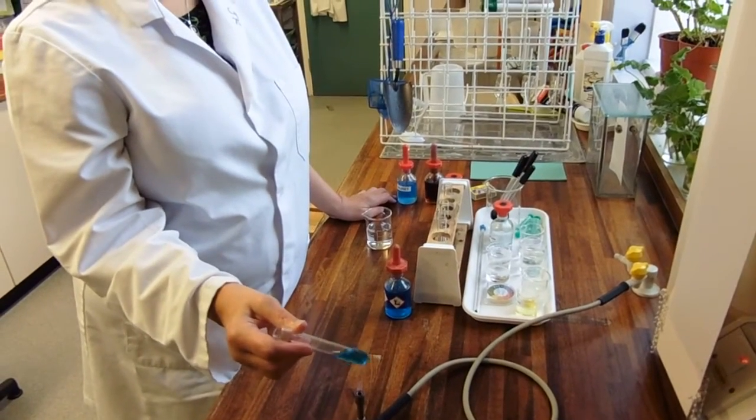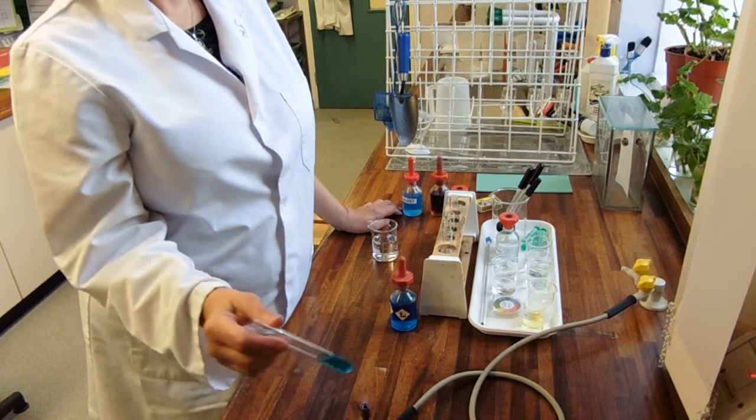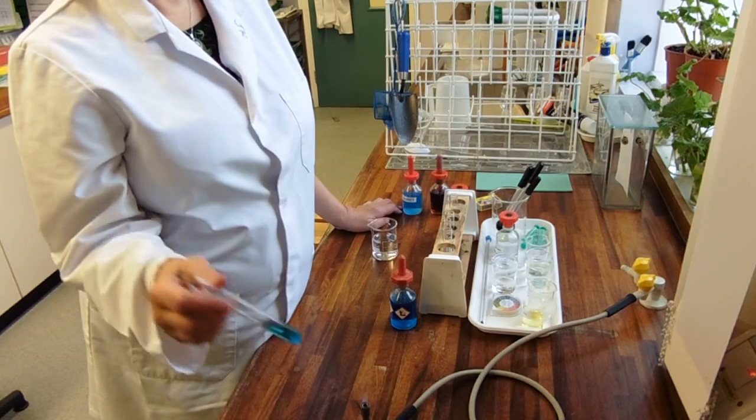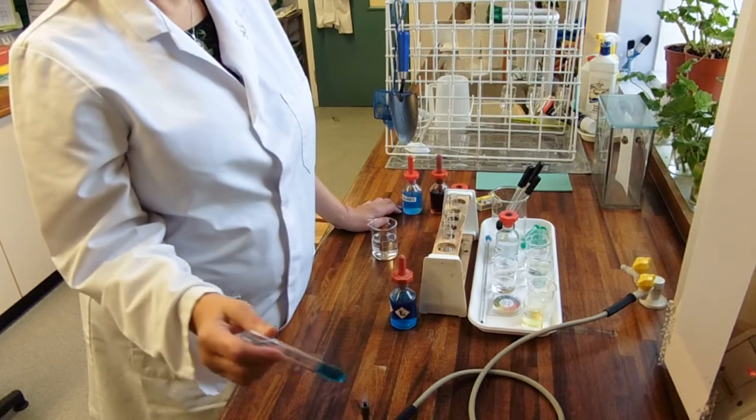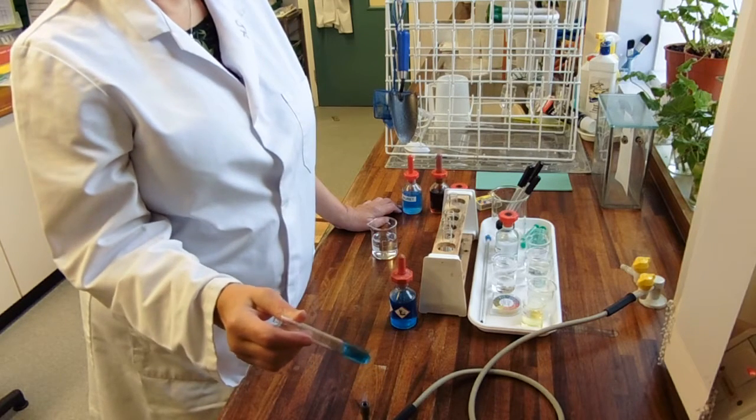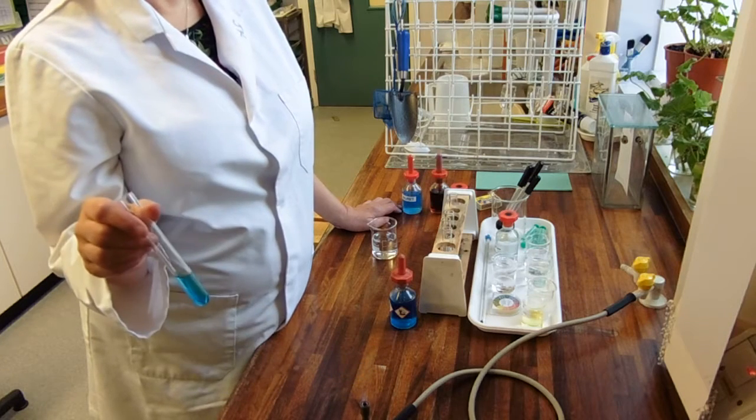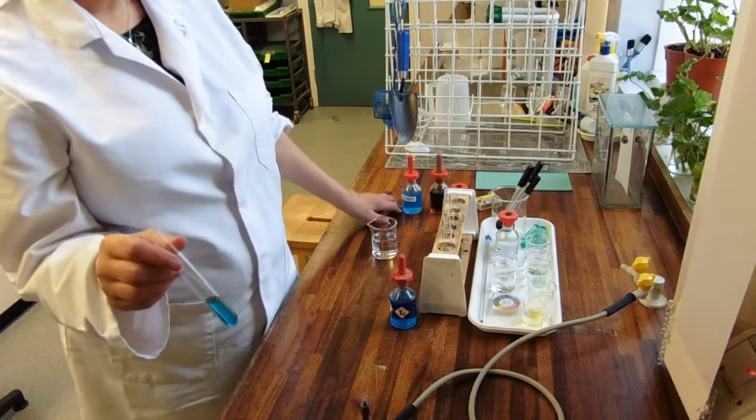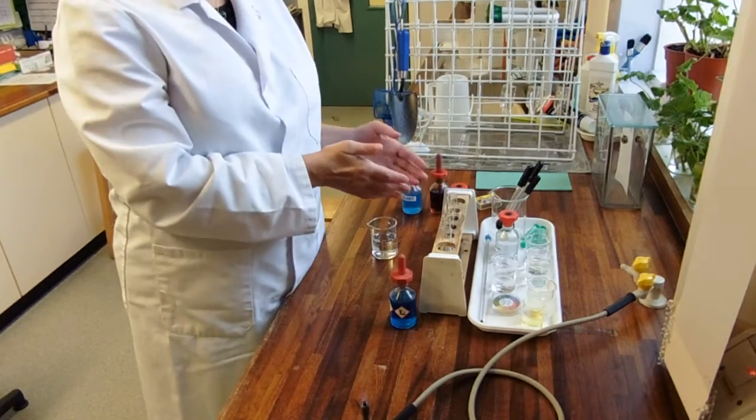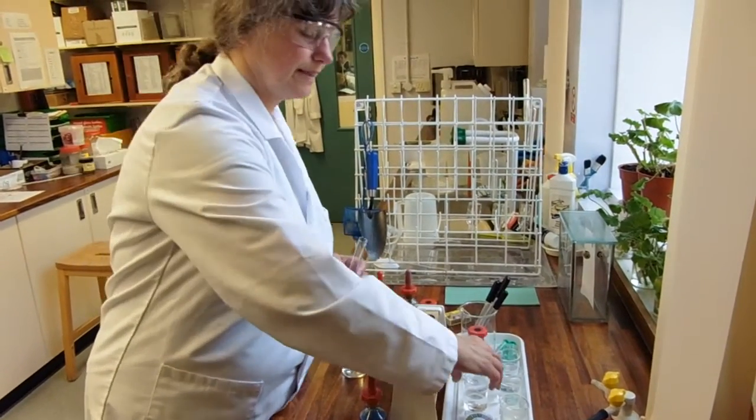So if you can imagine, if you were testing say, sugar-free coke, has it really not got sugar in? You might take Benedicts, you'd heat it up, it's not going to change colour. But if the manufacturer, if you're drinking roller cola and the manufacturer's decided to cheat, to give it a bit of flavour and has put some sucrose in, that still wouldn't show up. So, after you've heated your sucrose solution with Benedicts and it hasn't changed colour, you need to do it again.